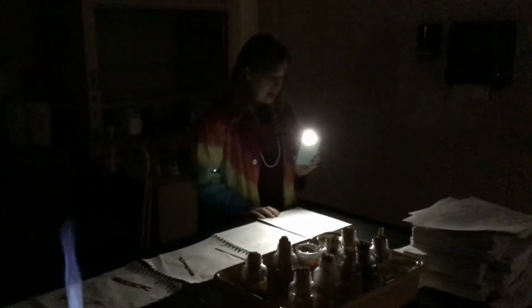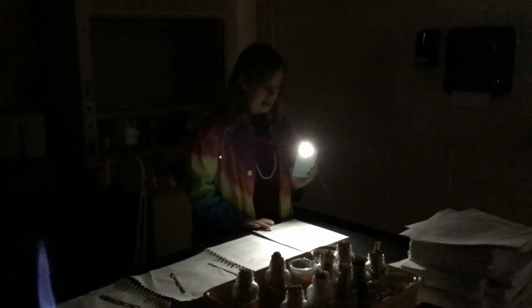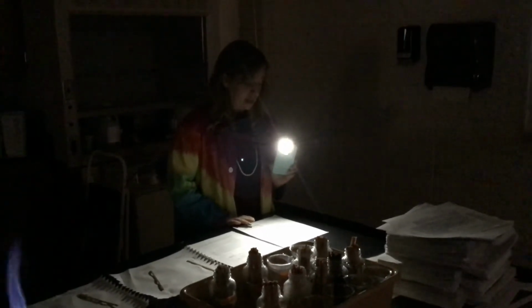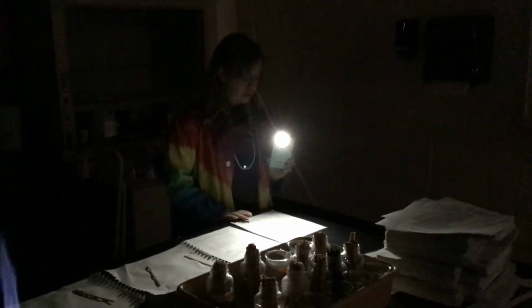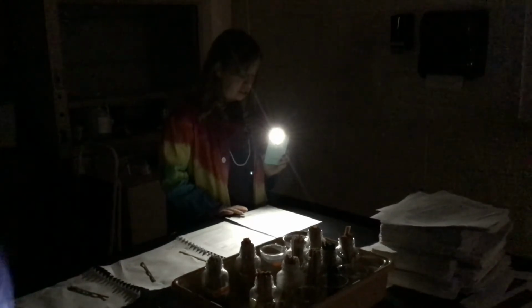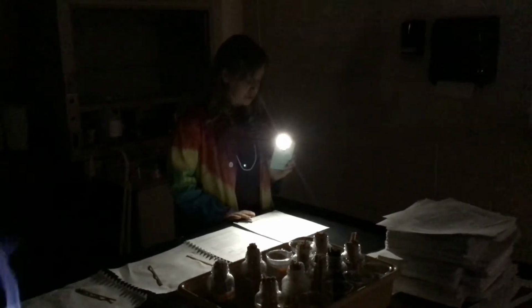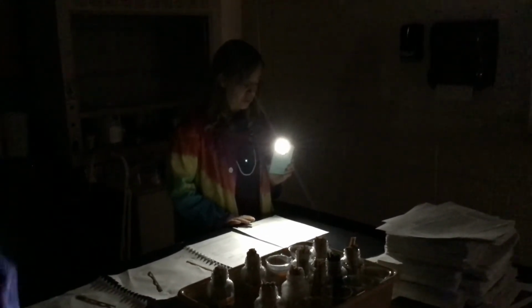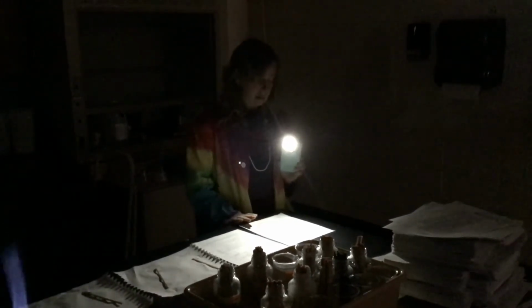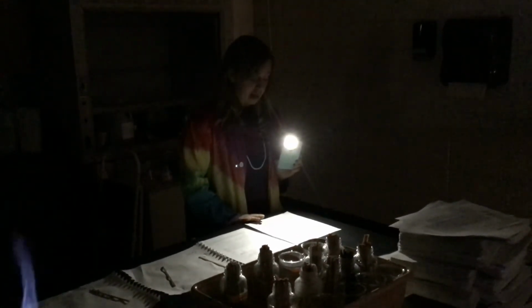When the electrons in an atom are bombarded with energy from an outside source, however, they absorb that energy and jump temporarily to a higher energy level. The electrons are said to be in an excited state when this happens. When those electrons release that energy, it is emitted in the form of electromagnetic radiation. If that electromagnetic radiation falls between 400 and 700 nanometers in wavelength, it is given off in the form of visible light. Many common metal ions, such as lithium, sodium, potassium, calcium, barium, strontium, and copper, produce a distinct color of visible light when they are heated.